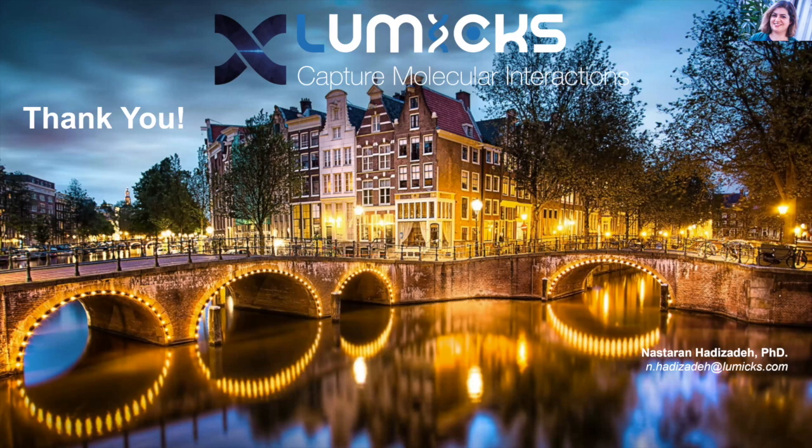But in terms of how we define high throughput experiments in these kinds of assays, it is based on how fast you can collect data, and that is possible with automating the whole workflow with software. Does anyone have any other questions?